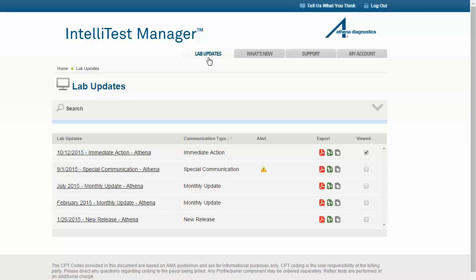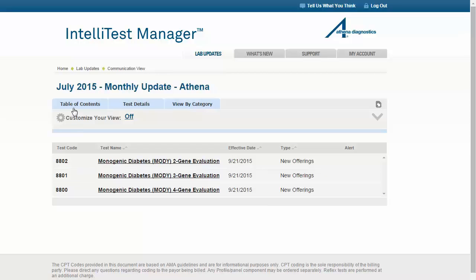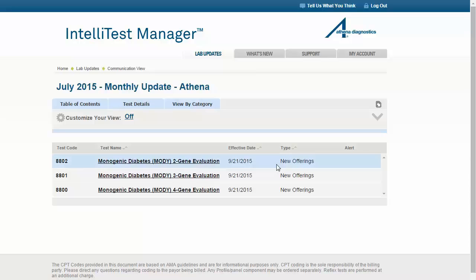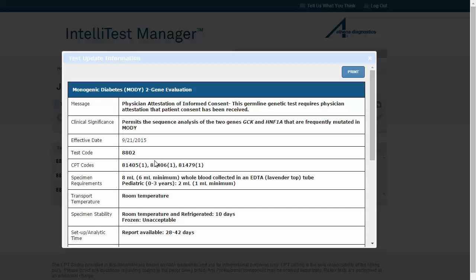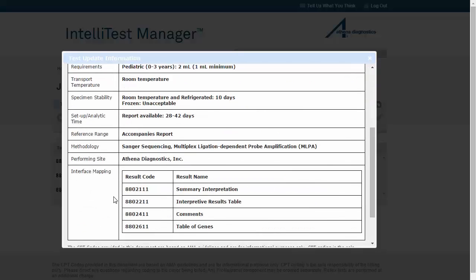While on the Lab Updates page, click on the title of a communication to view its details. Each communication contains three tabs providing different ways to view the information. On the default tab, Table of Contents, you will see a listing of all the tests covered in the communication, their effective dates, and the type of communication that they are. New offerings include the most detailed amount of information. To see these details, click on the test name. Here you will find items such as CPT codes, specimen requirements, transport temperature, and interface mapping.